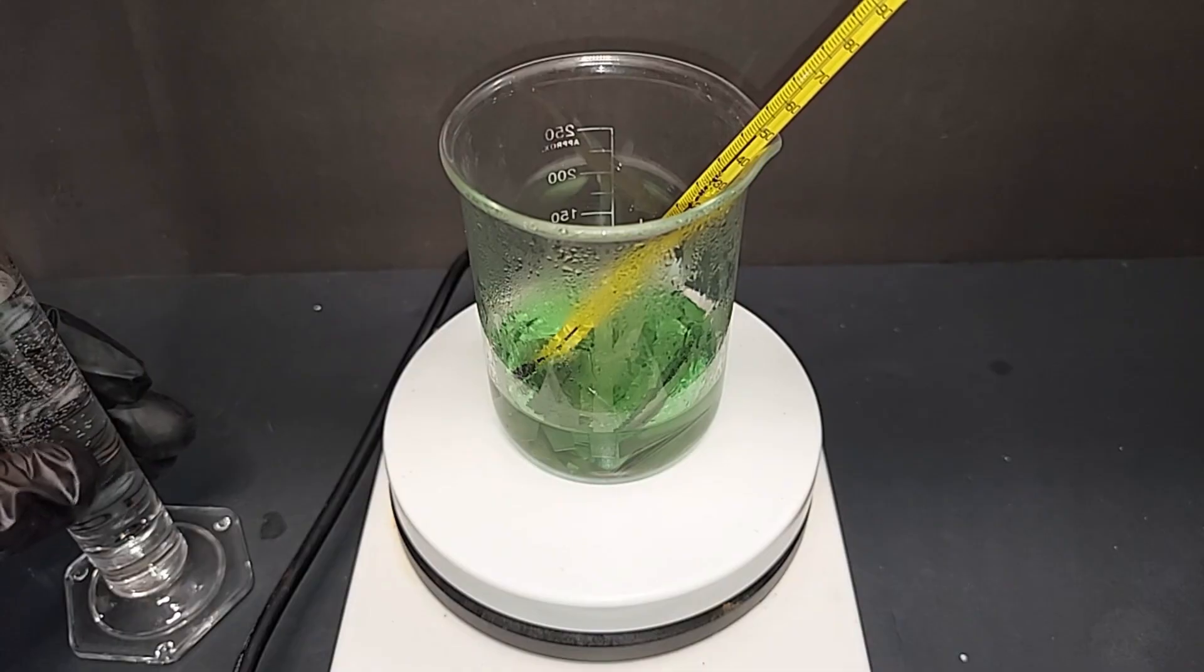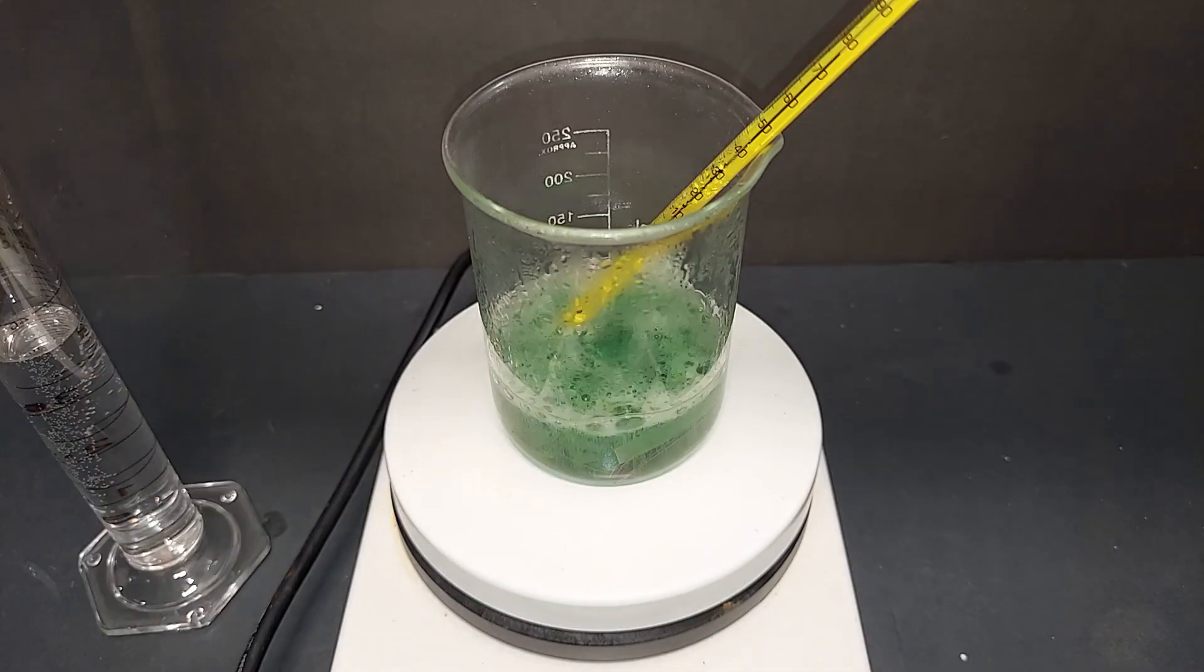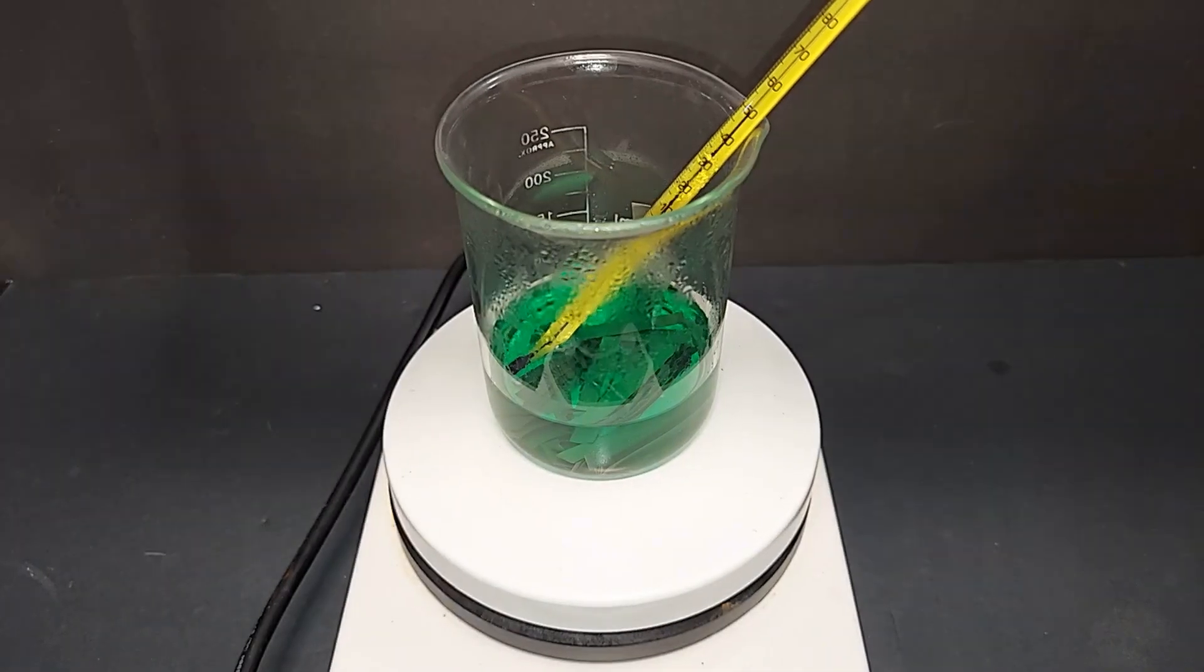I added about 15 milliliters total of the 20% and it helped—it's darker green meaning the nickel is more dissolved and we're getting some nickel chloride. But that's not going to be enough, so I'm going to add here approximately 5 milliliters of additional 30% hydrochloric acid.